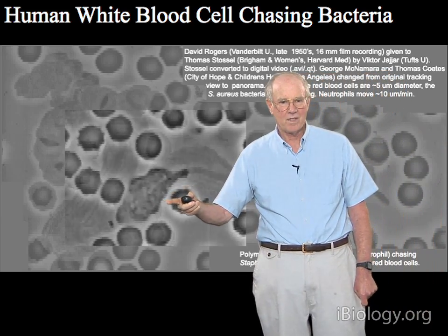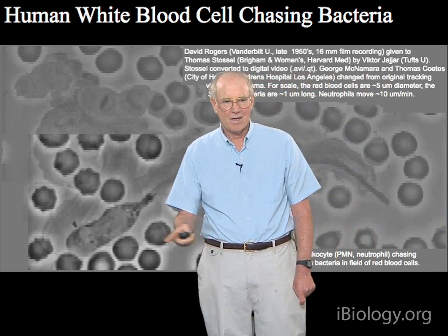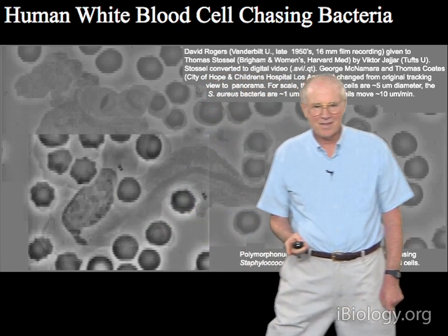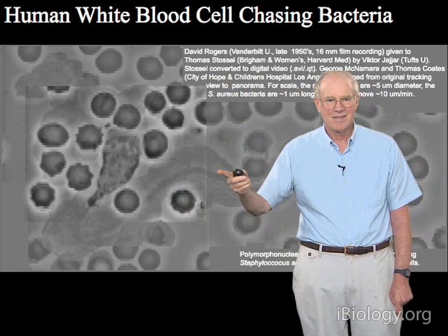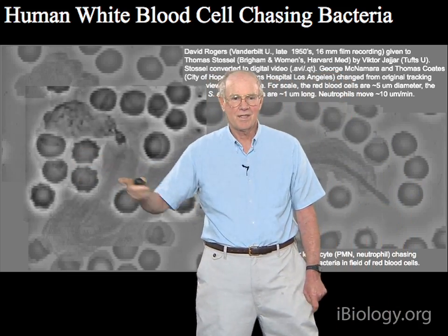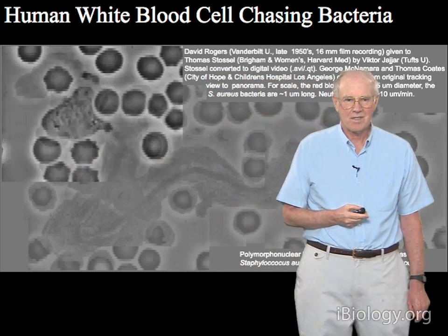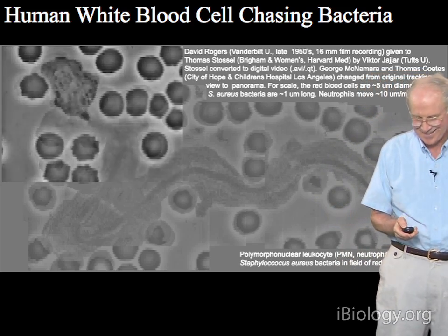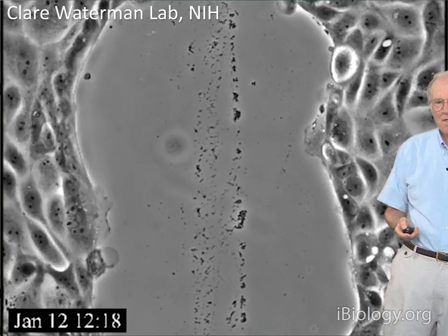Now we've moved over into here, and now it's right there. The bacteria is still away. Finally, up here, right up in there, you can see that phagocytosis has just taken place and it's eating the bacteria. I like that.